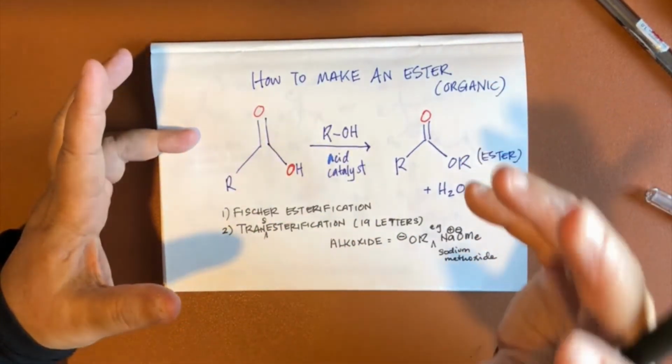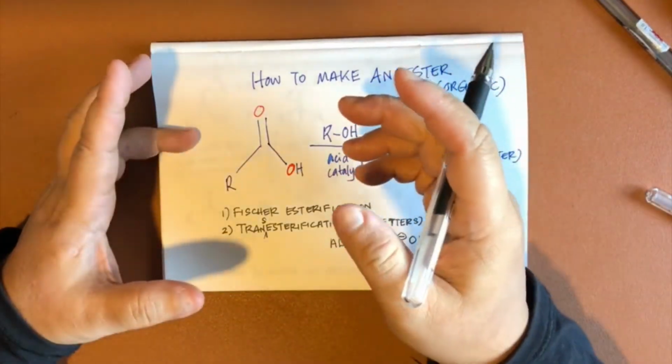How to make an ester, the second method.